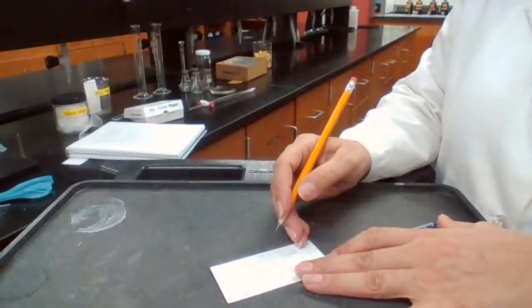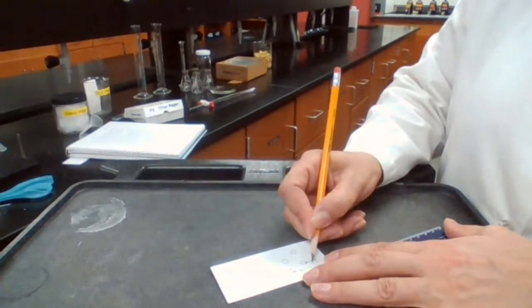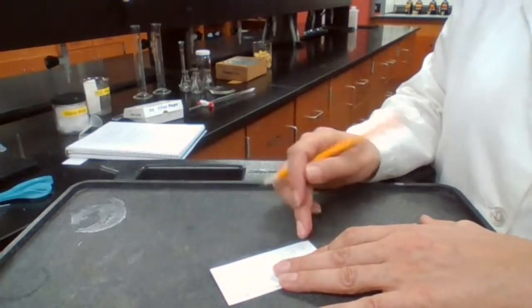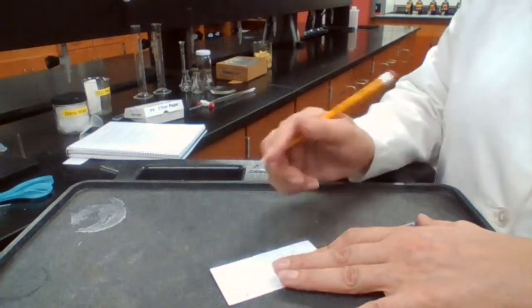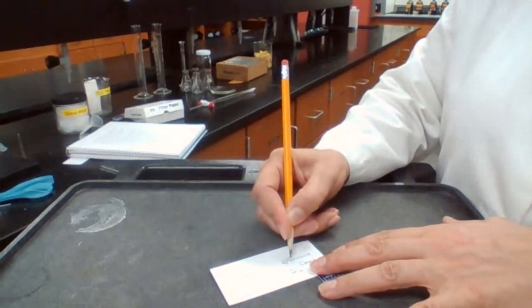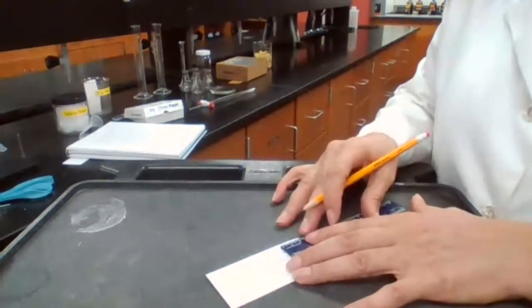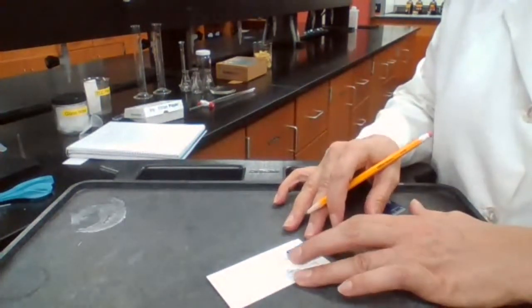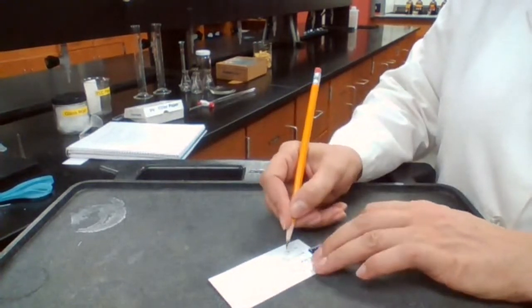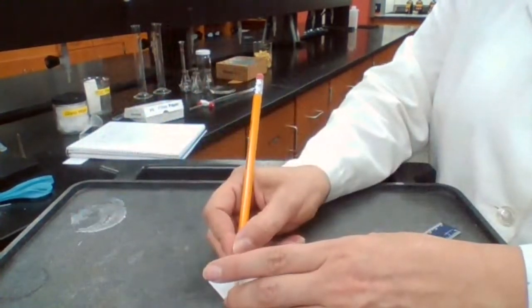For compound 2 it is 1.2. For compound 3 it is 2.8. And for compound 4, 1.2. And these are all in centimeters.